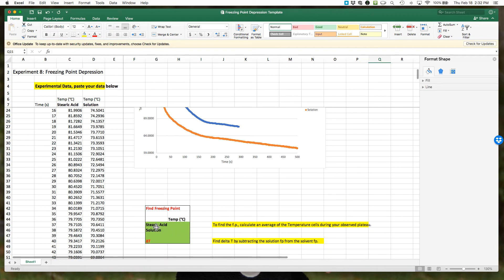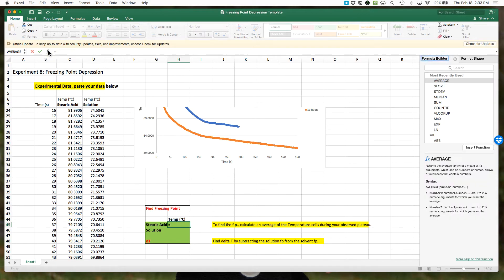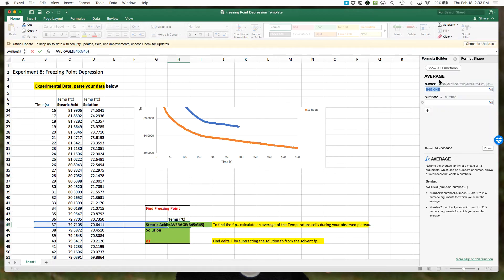I'm going to come down here to the steric acid box, click on this. I'm going to hit the equals key to start a formula, come up here, click our little fx Insert Function. That should bring up my function box. Double-click on Average.